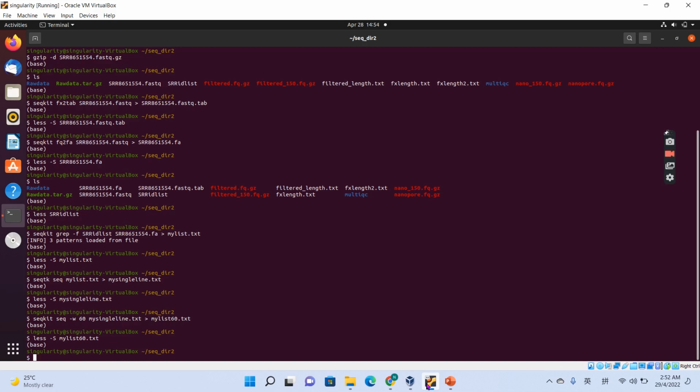I prepare it in this MULTIQC folder. So play into my MULTIQC folder first. You might be using your own sequencing raw data to perform the QC. I'm just using my sequencing data as an example.